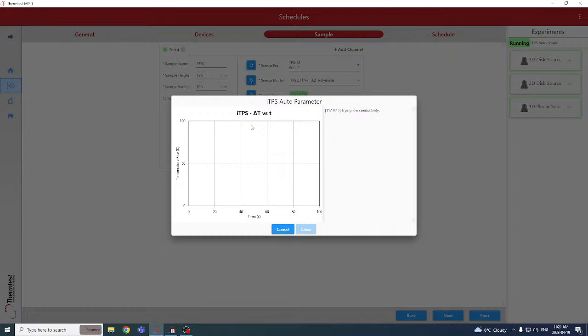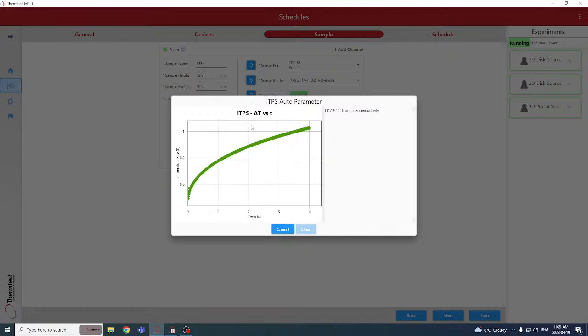So it is balancing the bridge right now. It will make a continuous measurement from too short to too long. And that little gap in between the too short period and the different lengths of time is the delay when the instrument is feeding the data to the analysis application for calculating what the diffusivity is and what the properties are at that time.